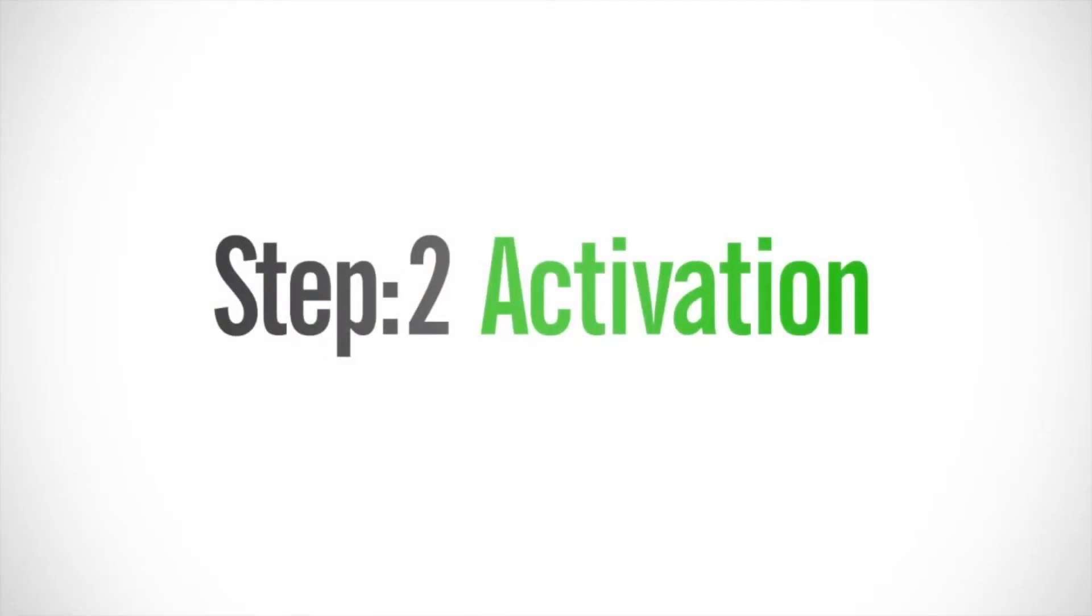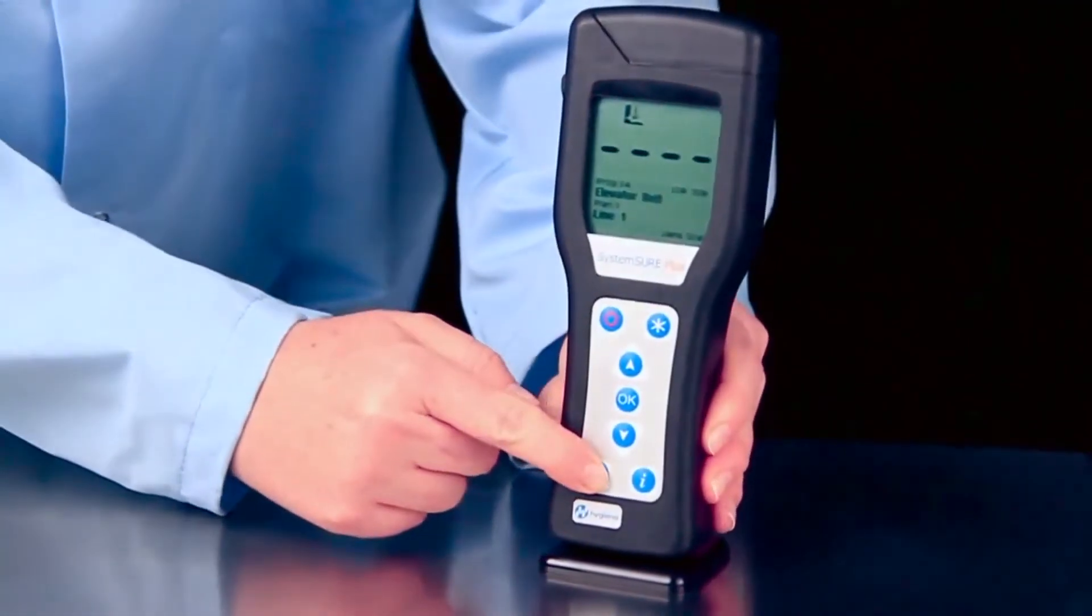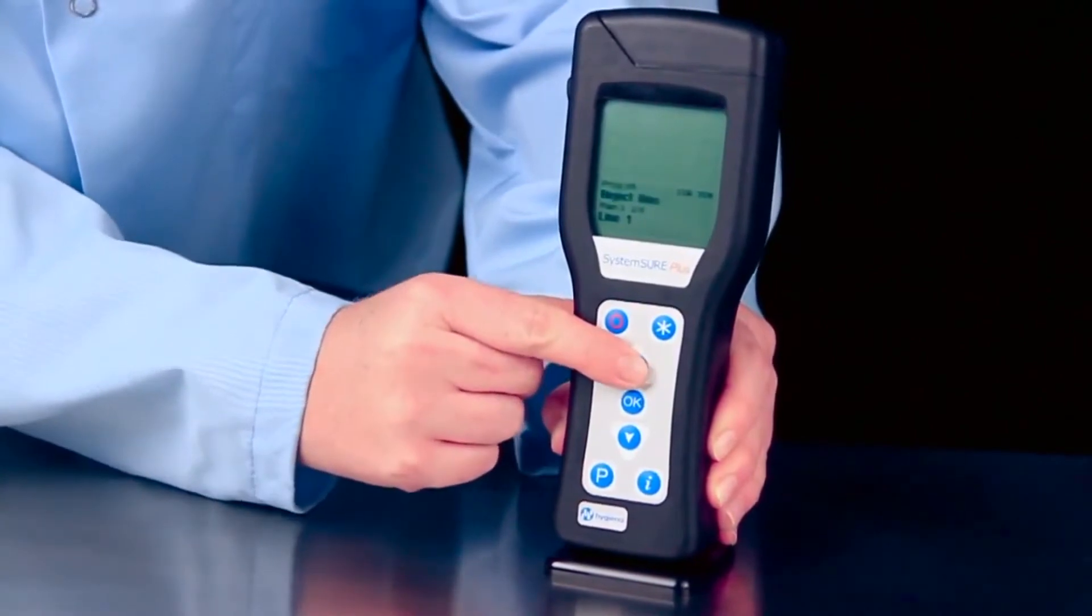The second step is activation. If you've programmed locations in the luminometer, select the location to be tested.